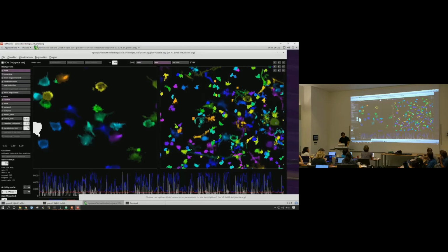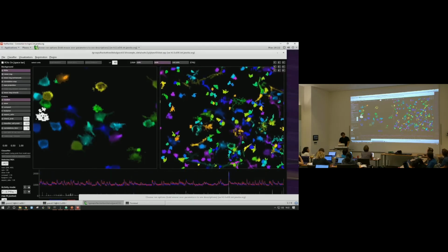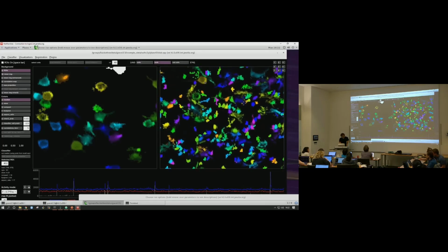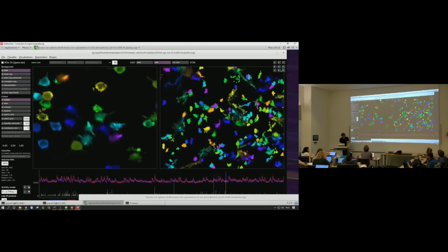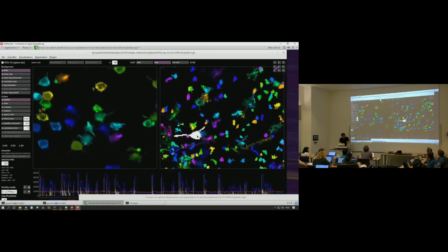So what we'll do is I'm just going to go through, and whatever I think is a cell, for now I'm just going to move through here and get the obvious ones. Now some of them are not going to be so obvious, and you might have to switch back and forth between different views to get a good sense. Or you might want to click on it, and if you click on it, you'll see that.